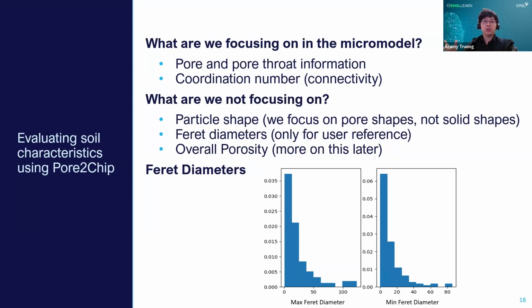But this illustrates a difference between previous efforts of making a micromodel, which would be you would pack a bunch of spheres together and then take a slice of that sphere packing, and you get a somewhat heterogeneous looking pore network, but it didn't capture the pore connectivity and the pore aspects that you would get with using our method.